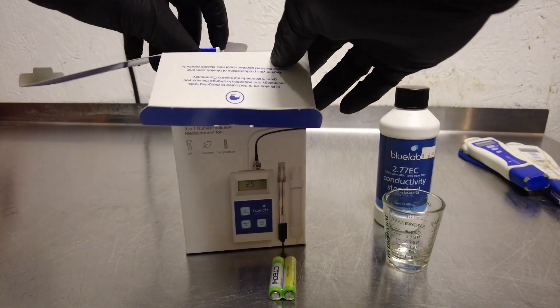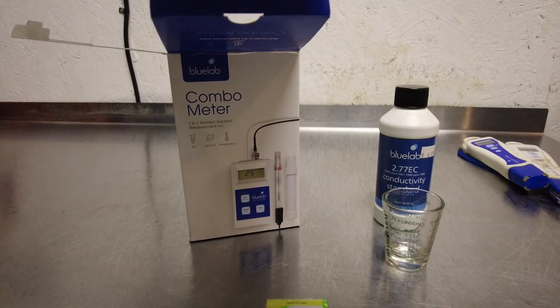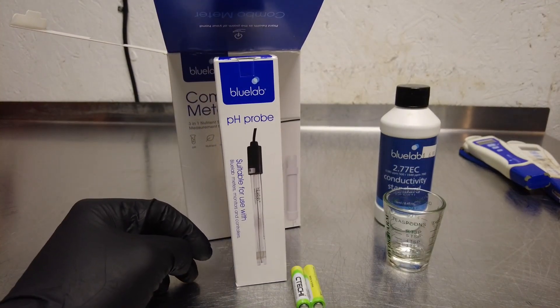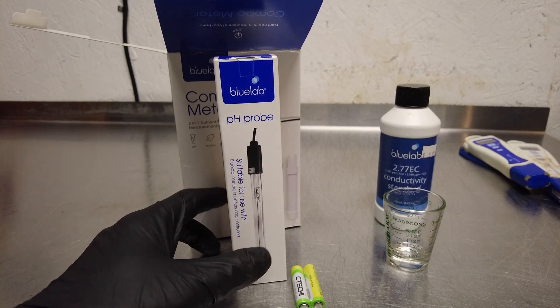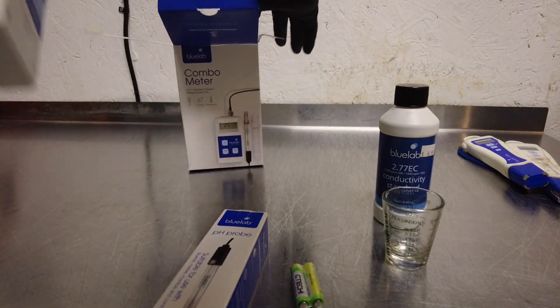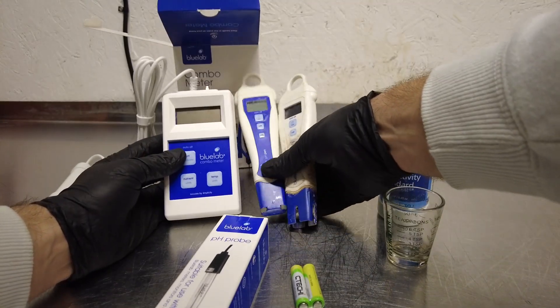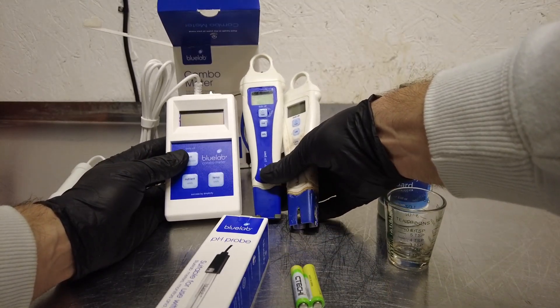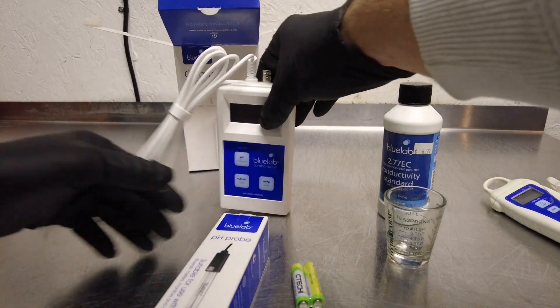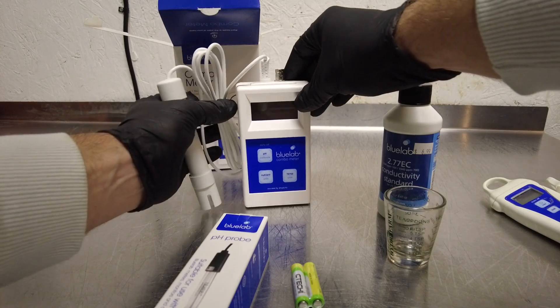Inside the box it does come with two triple-A batteries, which you will need. It also has the pH probe here, which is nice because you can replace this probe if it goes bad or you let it dry out. You've got the unit itself, and then attached to that is your EC probe which also shows your temperature readings.